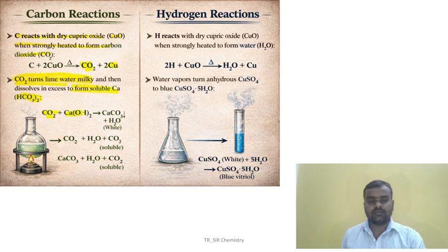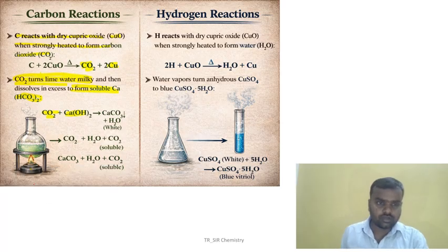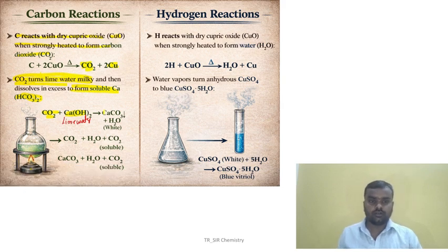Carbon dioxide plus lime water. The name of this one will be lime water. This is the lime water. Now, next what happens? So what is forming here? A white precipitate is forming here.